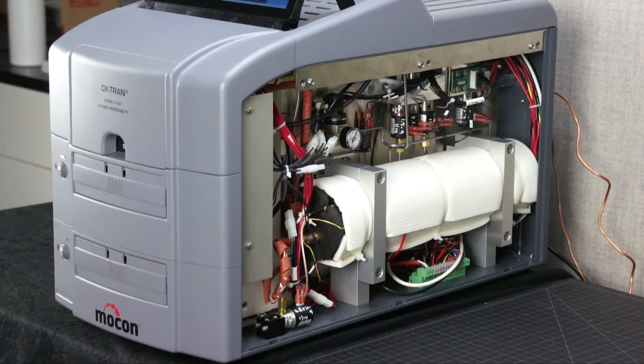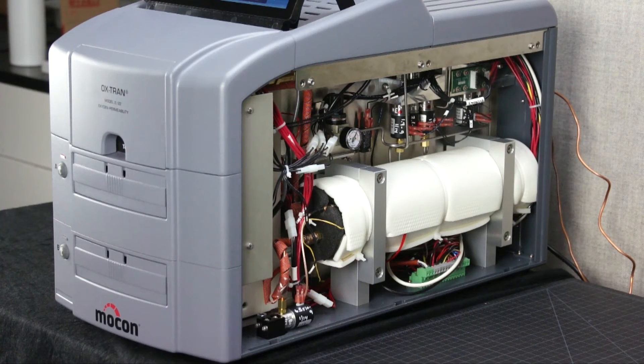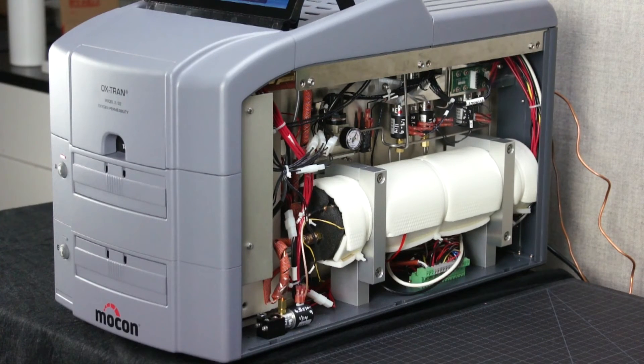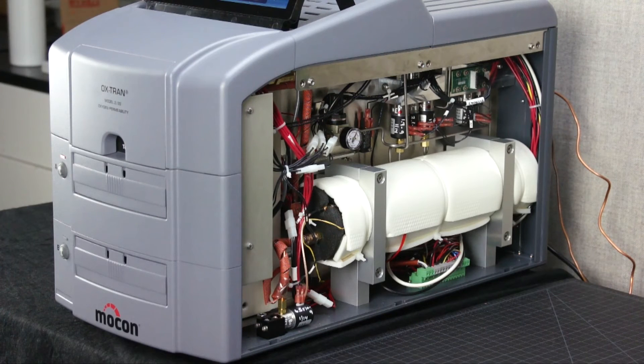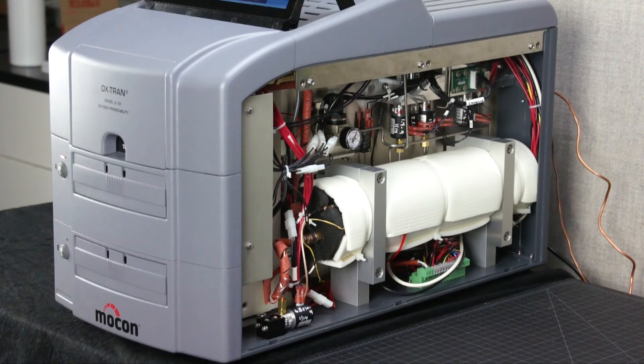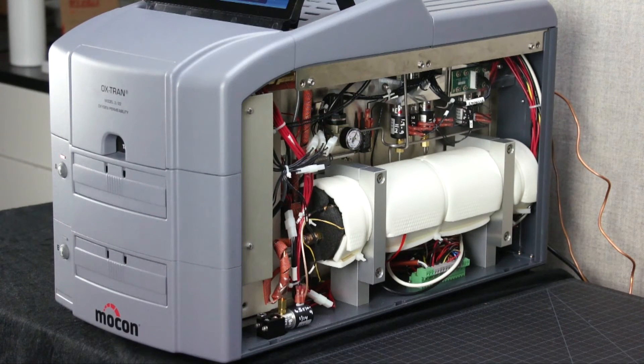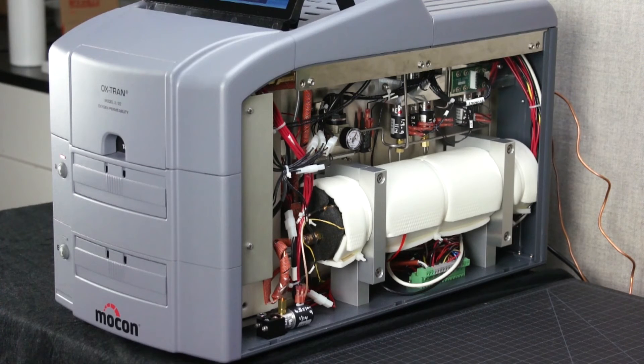This is an absolute sensor that measures every molecule that permeates through the film, a reason why MoCon instruments are the only instruments that can conform with ASTM D3985.